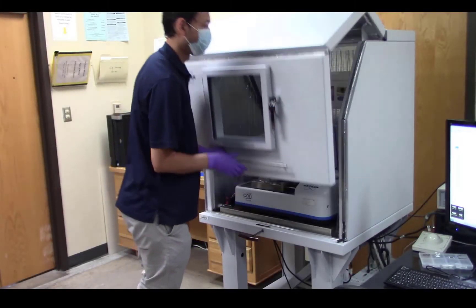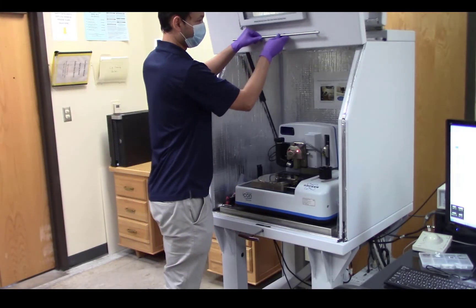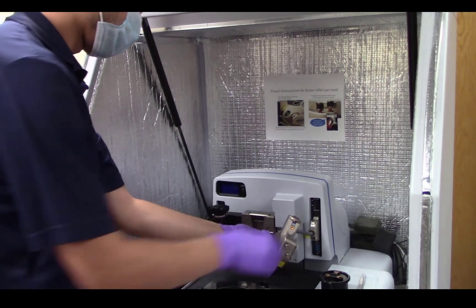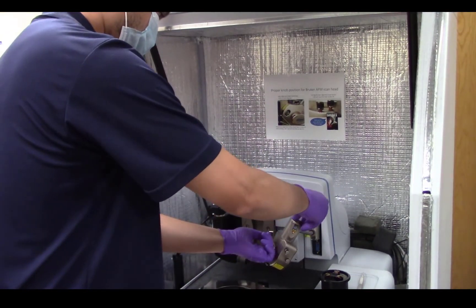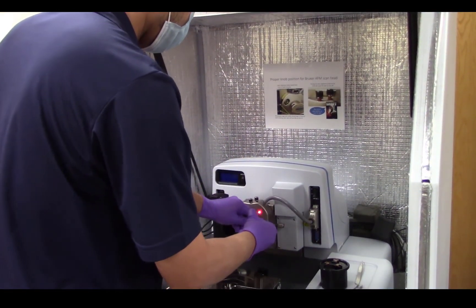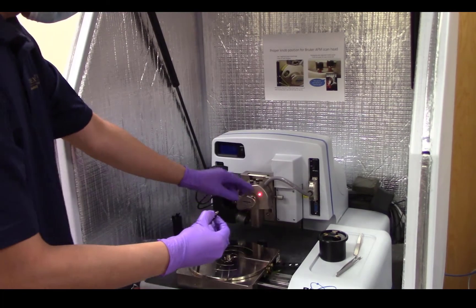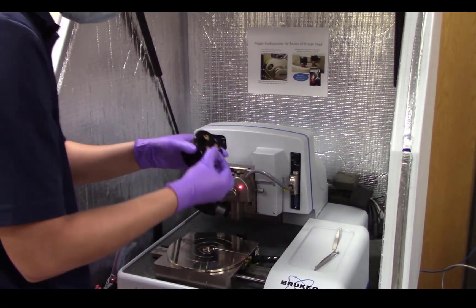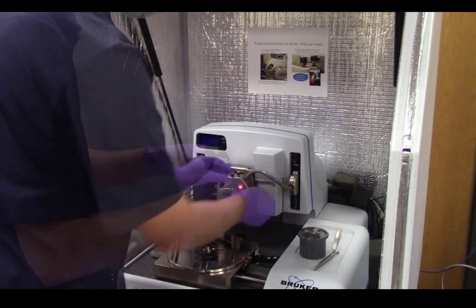Next, open the AFM door, release the scan head, and remove your probe. Place the probe in the probe holder base and reinstall the scan head, tightening the set screw.